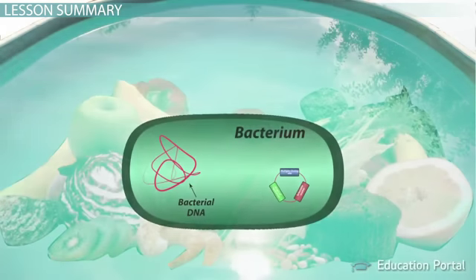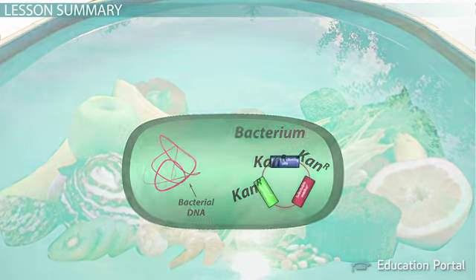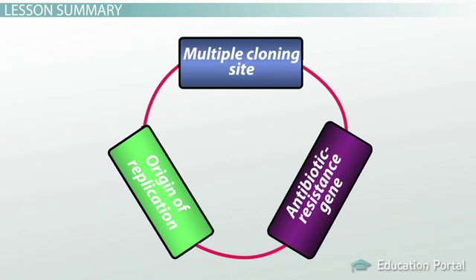The recovery step of a bacterial transformation experiment gives genetically engineered bacteria time to produce antibiotic resistance protein. In a bacterial transformation experiment, antibiotic selection is used to isolate transformed cells by eliminating the untransformed ones.